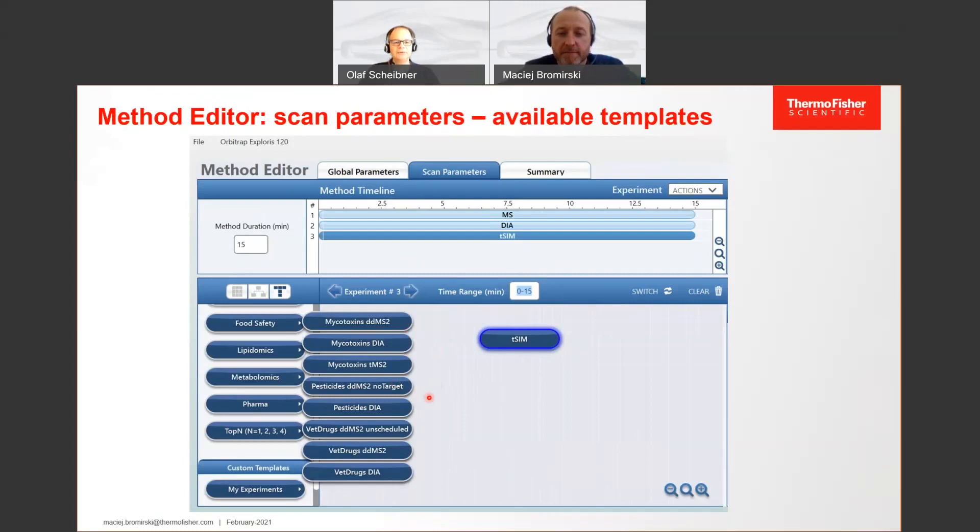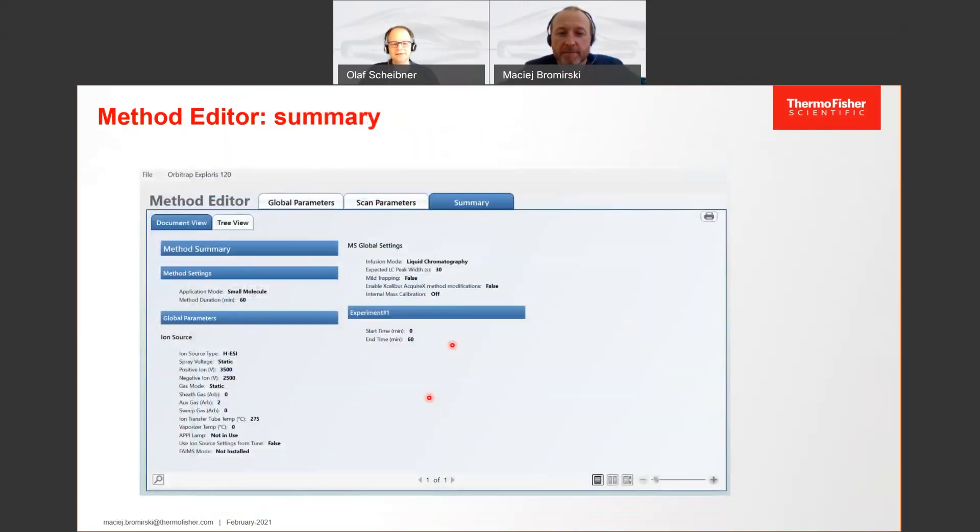Once you set up such a method, you will also find a nice summary at the end — easy to understand, with all parameters visible in one glimpse. These parameters are stored in the raw file. With the Exploris series, there is a new feature: if you have a raw file and know it was a good analysis but can't find the method, you can simply take the raw file and import the method directly into the method editor. This new functionality lets you retrieve all parameters with just a click, restoring everything exactly as it was run successfully.